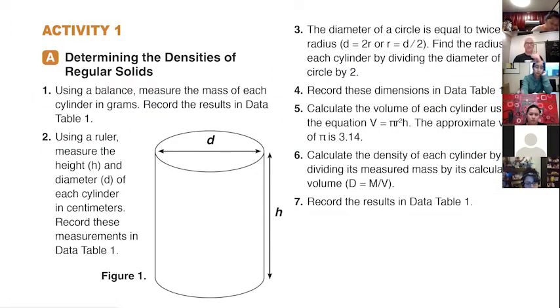So the very first activity will be to determine the densities of these solids. We'll be able to do this before putting our goggles on and going into it. So we're just going to take each one of them, and hopefully you found your ruler in there.